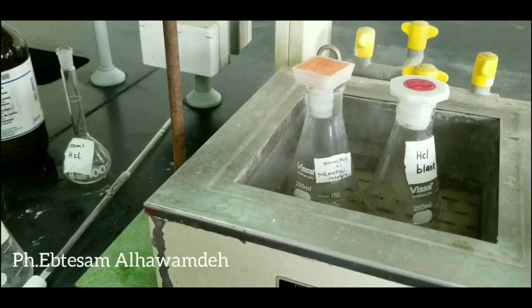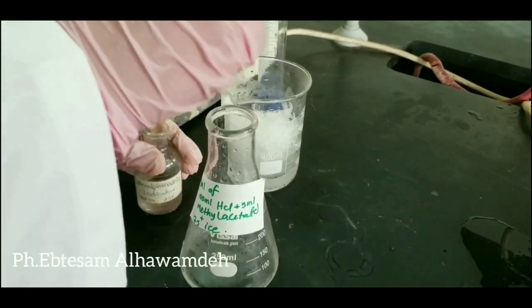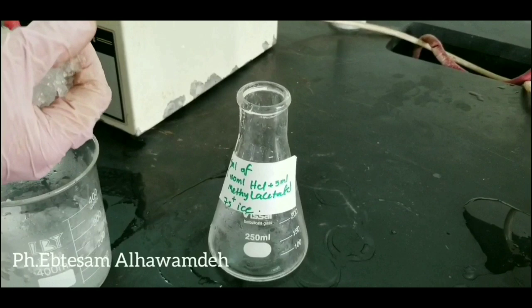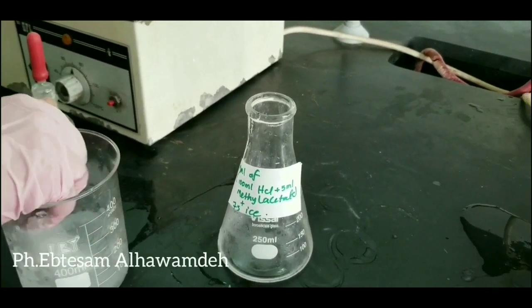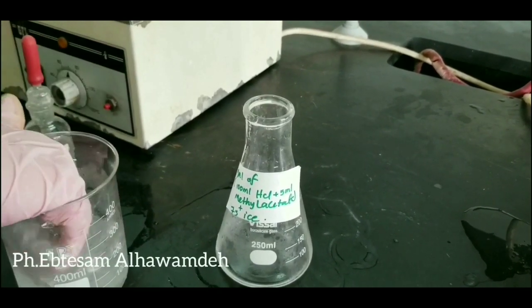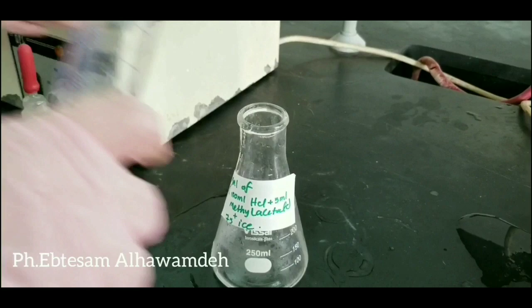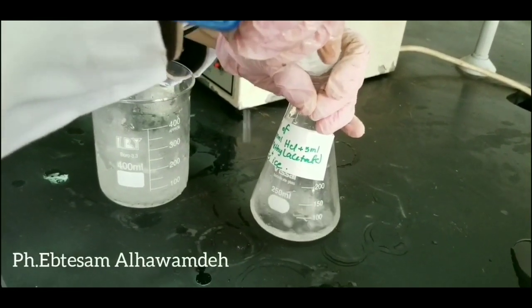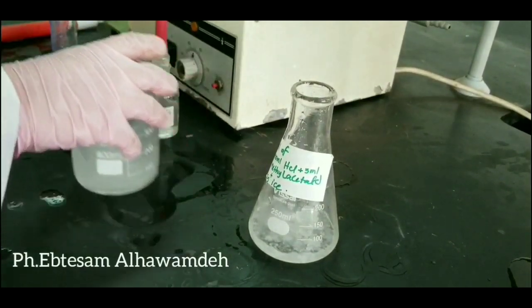Delivering the sample into the ice water slows down this reaction, but the titration of the sample should be accomplished as soon after sampling as possible. The endpoint is pink color.